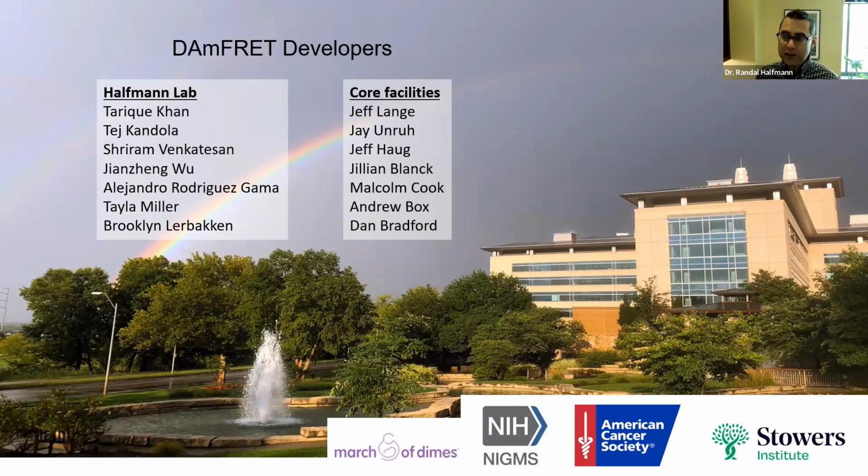You could also imagine just doing it in principle, and people have done this: you can actually just FACS aggregates themselves. If you have an in vitro system where you think you're achieving some appreciable population of the metastable species of interest, then you could, in principle, just FACS it directly. But man, that would be a lot of FACS time to accumulate enough particles to then do cryo-EM or something with them.